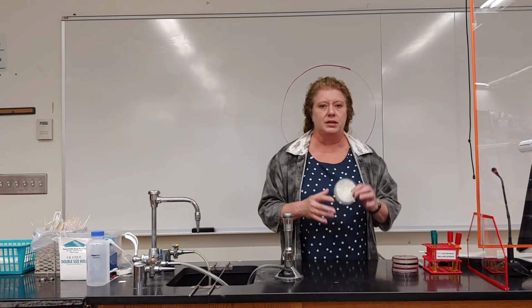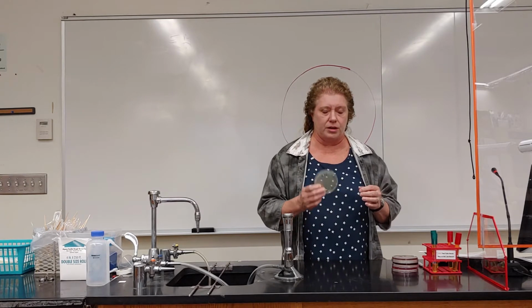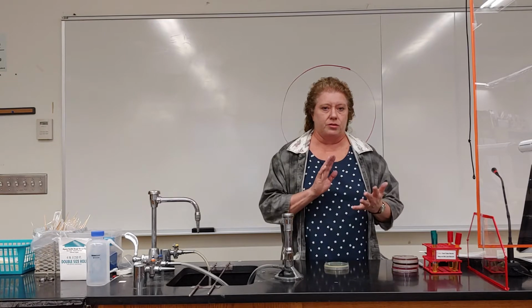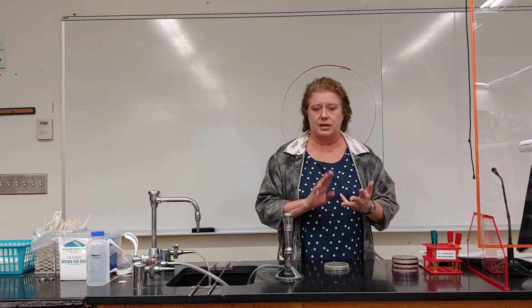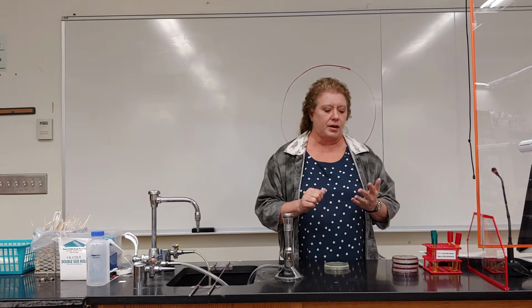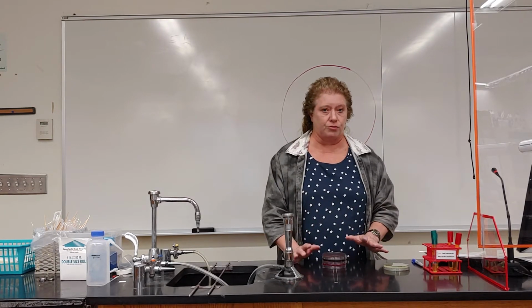In this case, the selective ingredient is phenyl ethyl alcohol. It's in this agar, and it will either allow growth or not allow growth, depending on the bacterial characteristics. Now the other 3 are selective and differential.